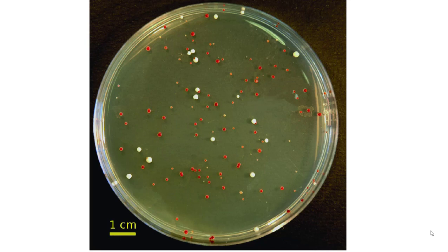them to different amounts of UV light. And by amounts, I mean different lengths of time. So we were going to expose one plate for 5 seconds of UV, one plate for 10 seconds, 15 seconds. So increasing dosage of UV in this case means increasing amounts of exposure. We were also going to have plates that had no exposure, so those would be the controls.